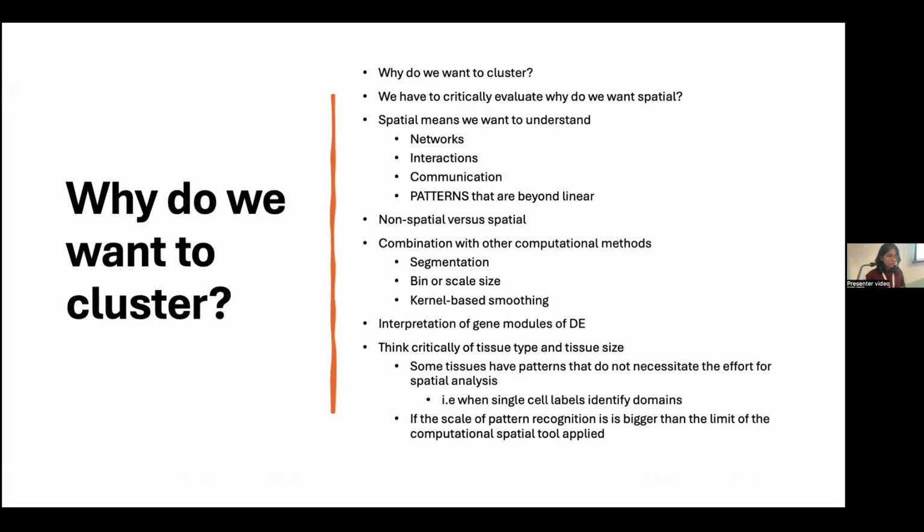Okay, so why do we want to cluster? These are all the steps that I'm going to go through. And based on all the questions that you've been asking and posted on Slack, at the end of this lecture, before we start the practical, I've chosen a select few of my favorite papers, which I'm going to review using the materials and methods and the concepts, because I thought I'd share with you how I went through the process of choosing the methods for my spatial analysis. It's a sort of sharing my own experience rather than just all theory.